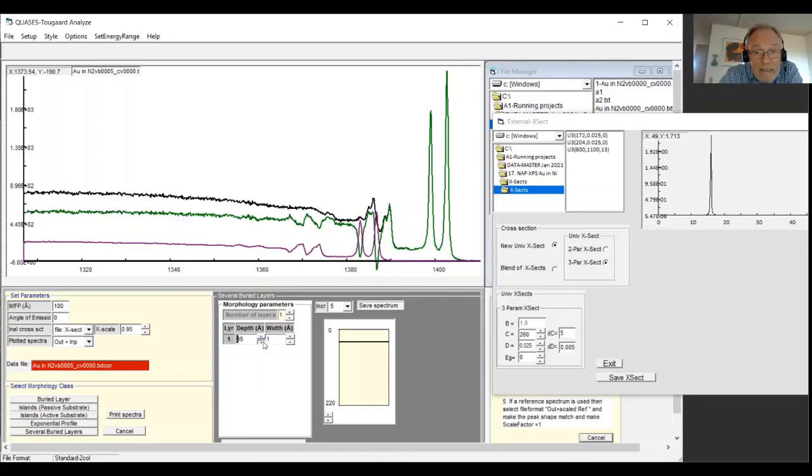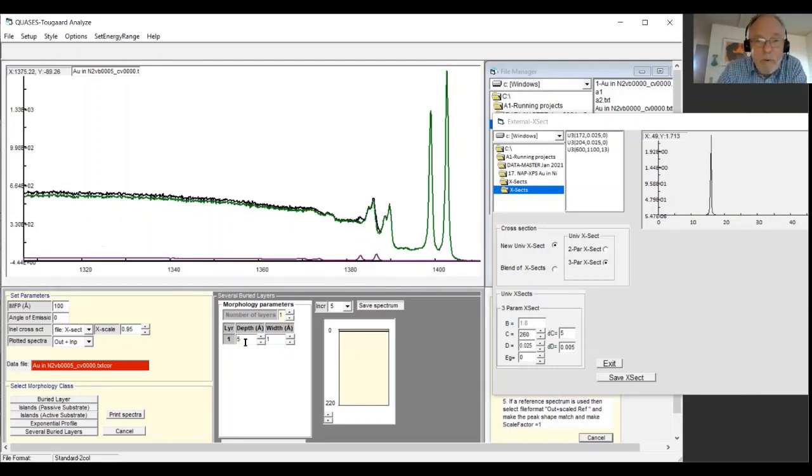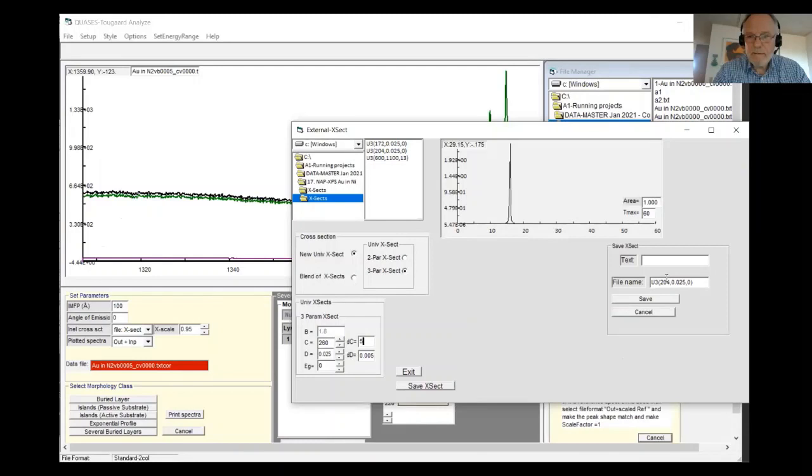The correct weight will be something like this, maybe, where you see now it's removed here. But we fine adjust the weights later on. So it takes care of this and some small peaks here corresponding to double scattering and triple scattering. So we save that as well. So that's now at 260. C was 260. The width was the same, sharp peak and 0 there for the band gap.